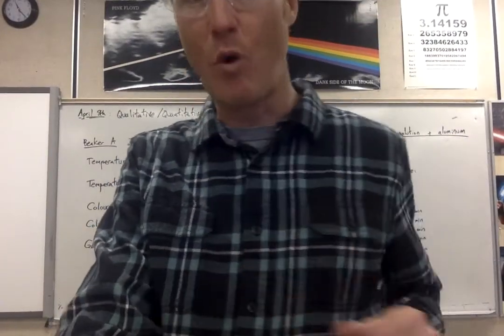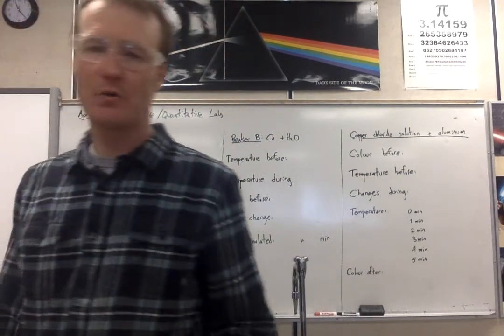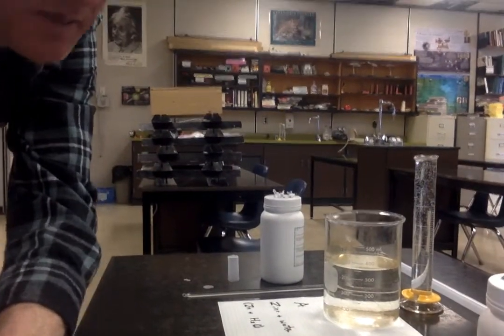I'm going to make a solution. You may remember that in a solution, there is a substance that's dissolved in some other substance. It's a mixture. Seawater is a solution, so is sugar water. But anytime you dissolve a chemical, like an ionic compound, in water or something else, you're making a solution, a liquid solution. Let's look at the first reaction. Please do read the directions, so it'll look a little bit like what I'm doing.